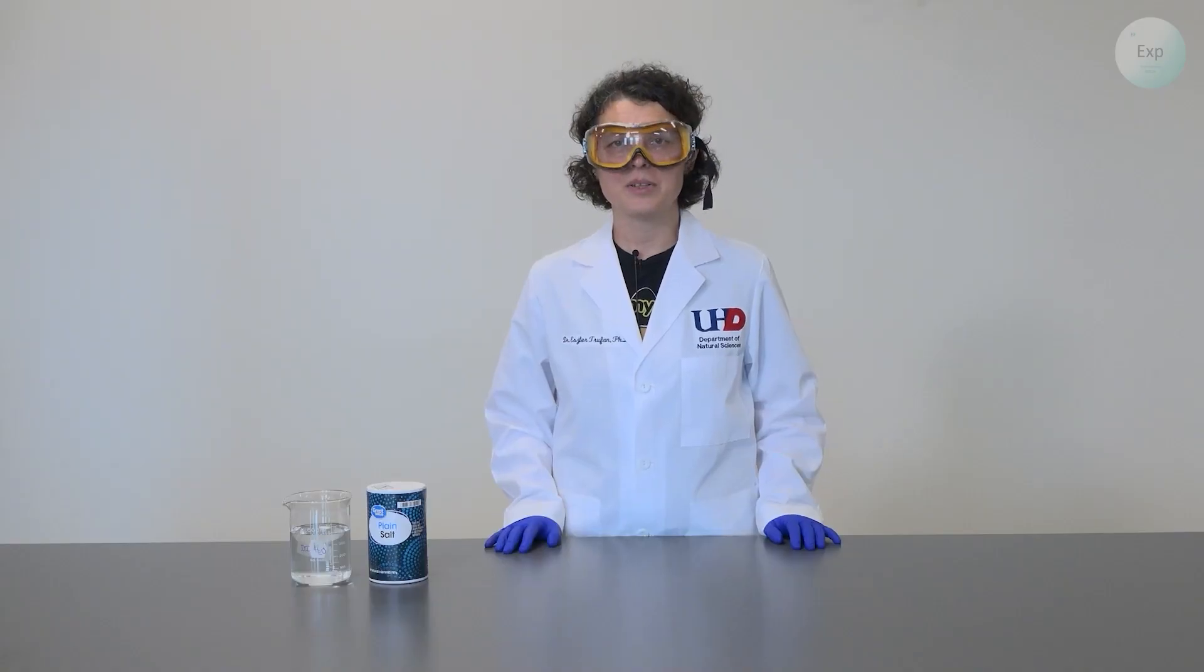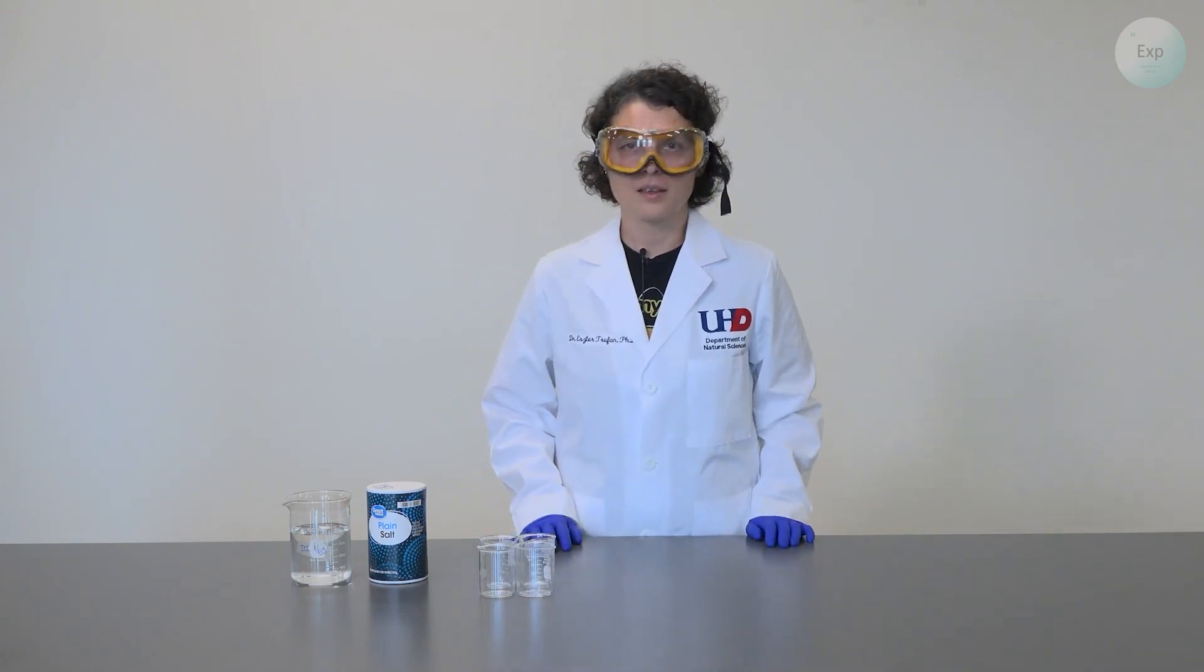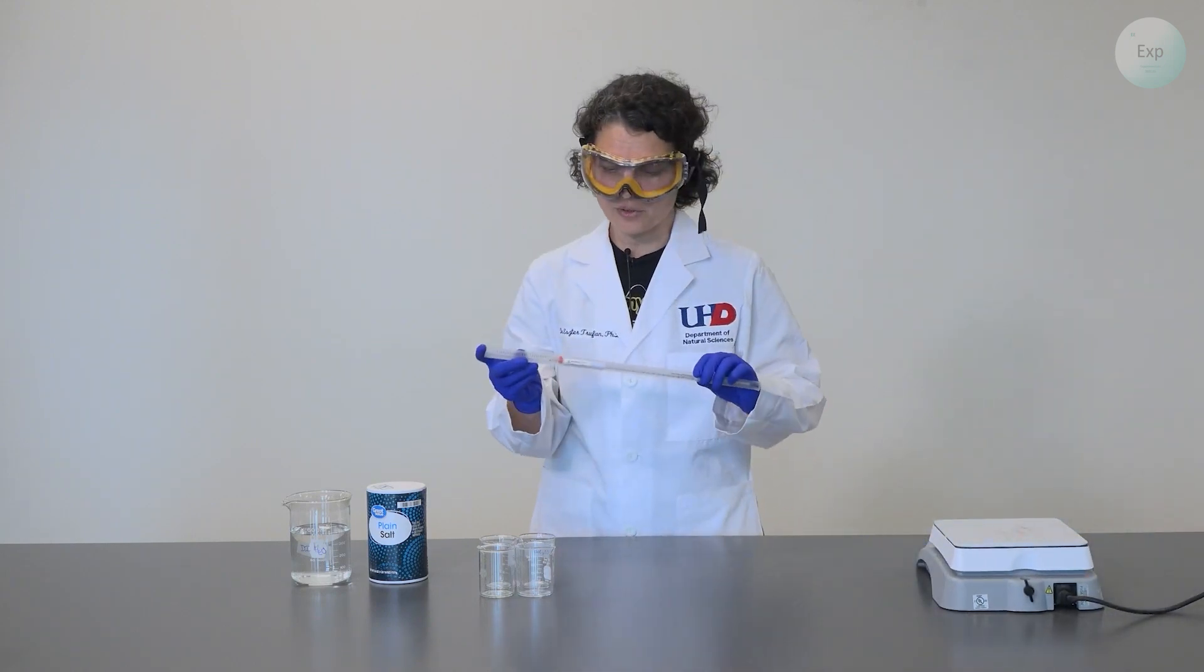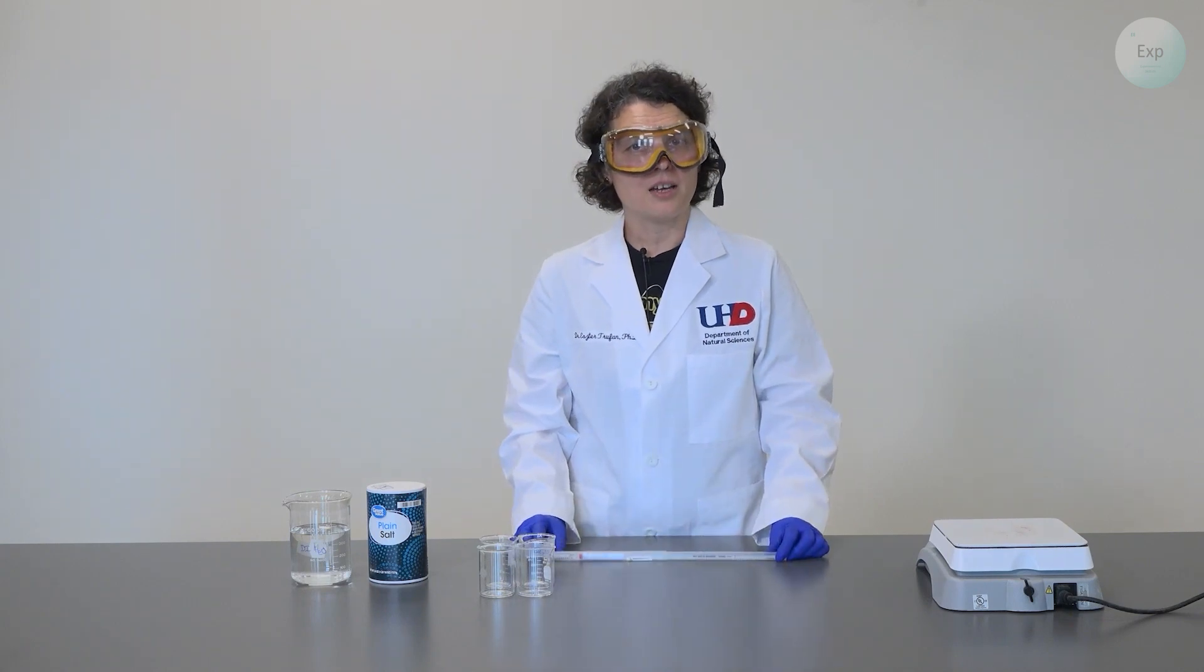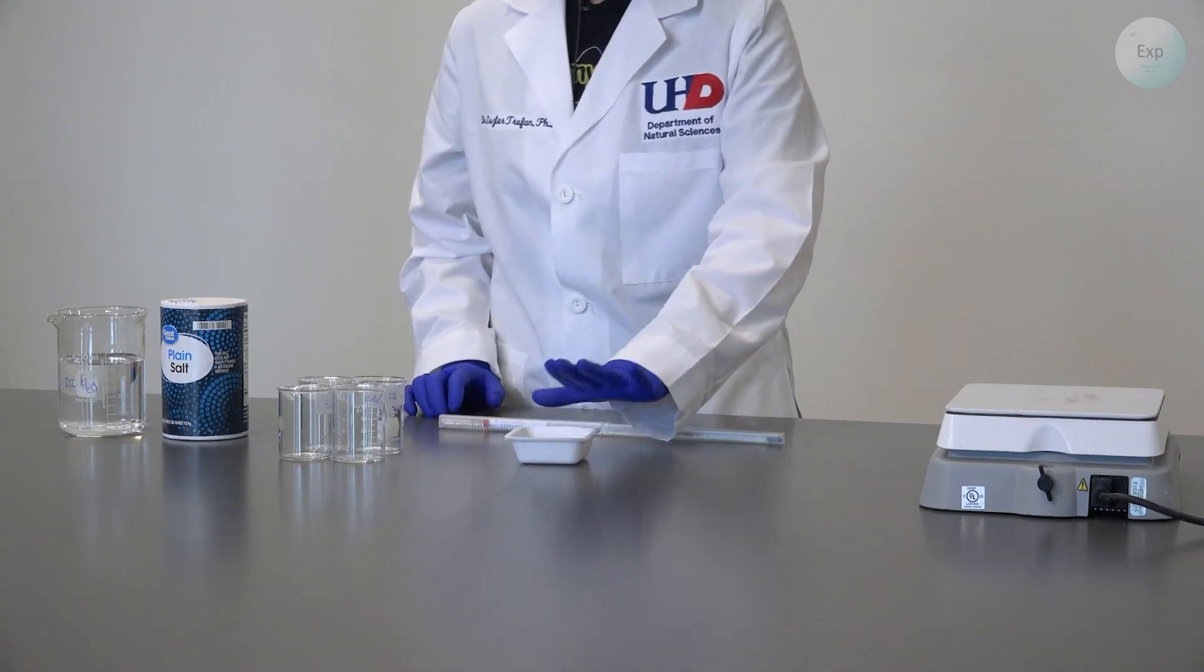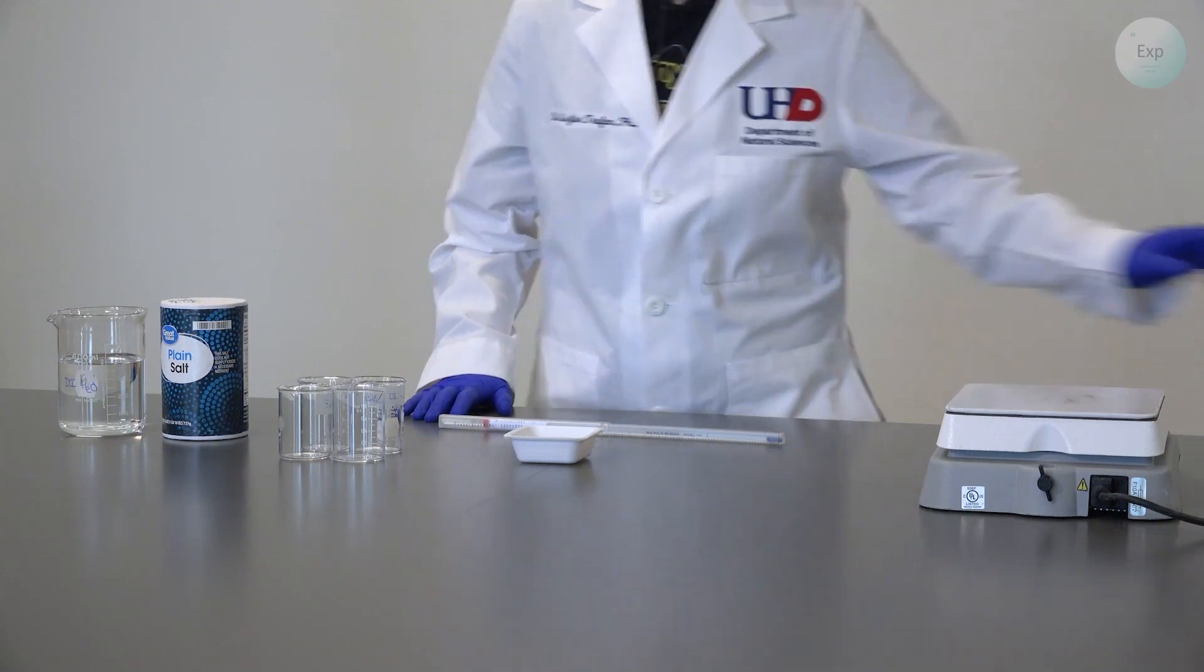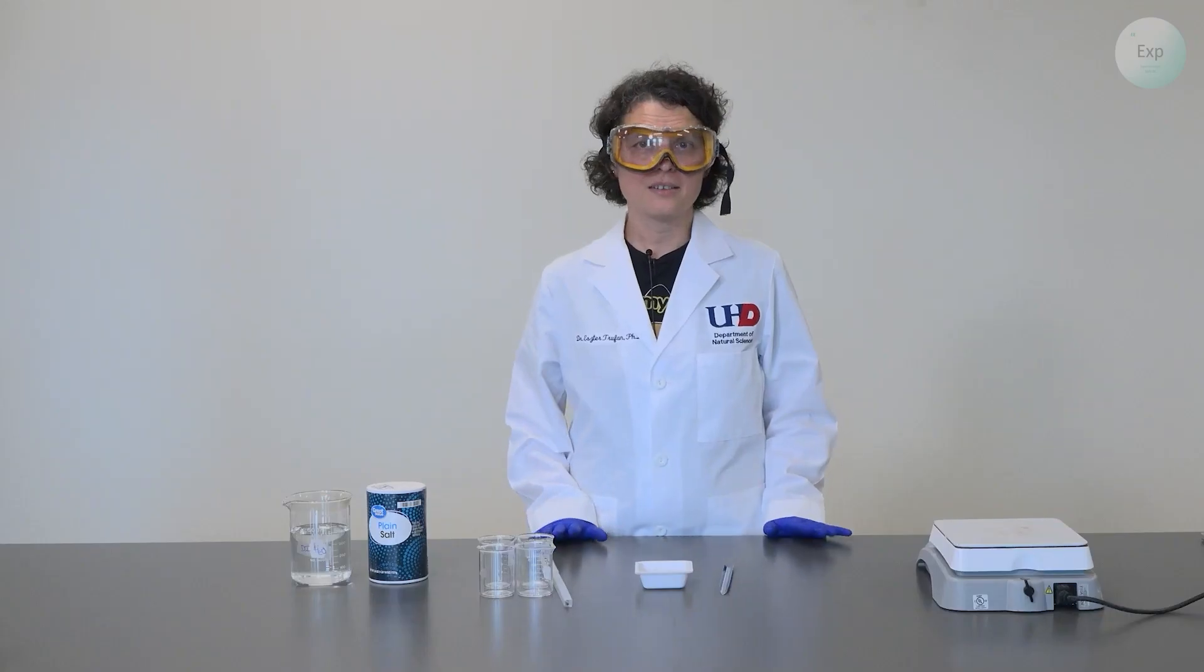On the equipment side, we will need four beakers, a hot plate, a thermometer that is able to go to above 100 degrees Celsius, three weighing boats (though you could use the same one if measuring the same chemical repeatedly), a spatula if needed, and finally, a scale.